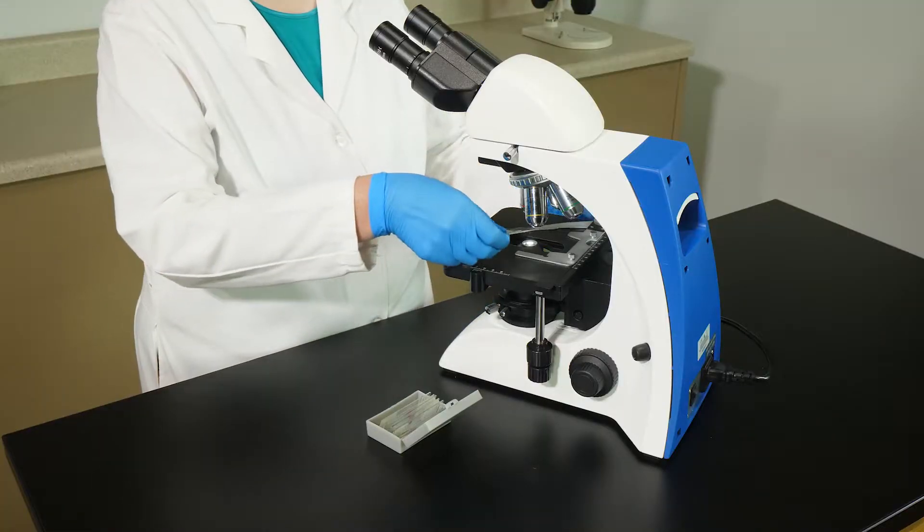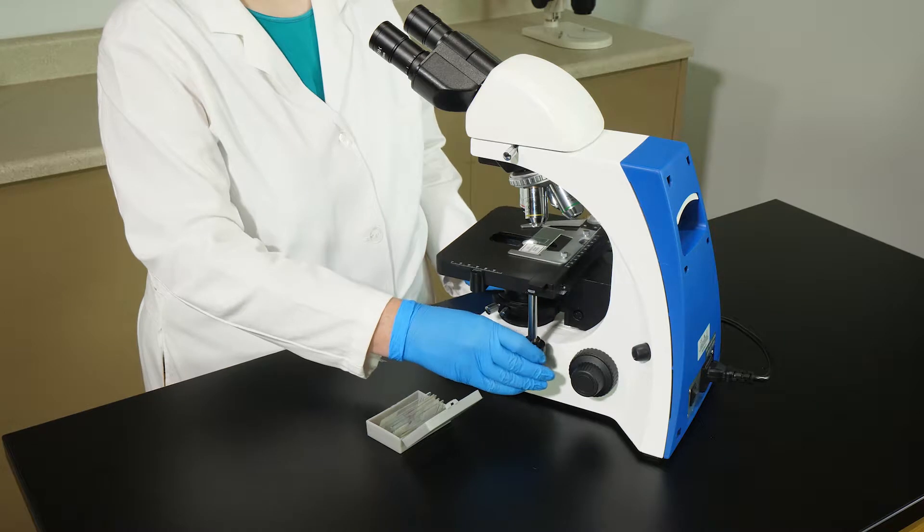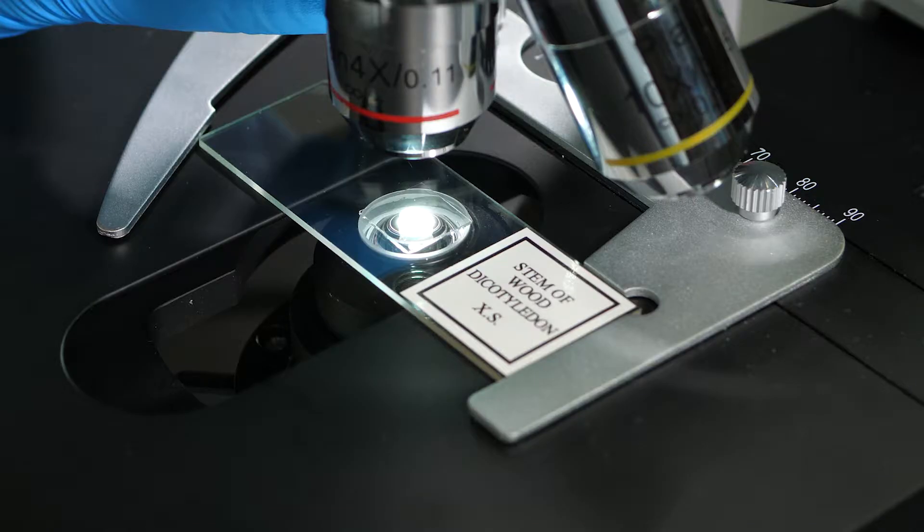To view a sample of a larger, thicker specimen, such as a woody dicot stem, a thin slice of the specimen is needed. Prepared microscope slides often contain thin cross-sections of a specimen, sealed in an airtight, watertight medium.